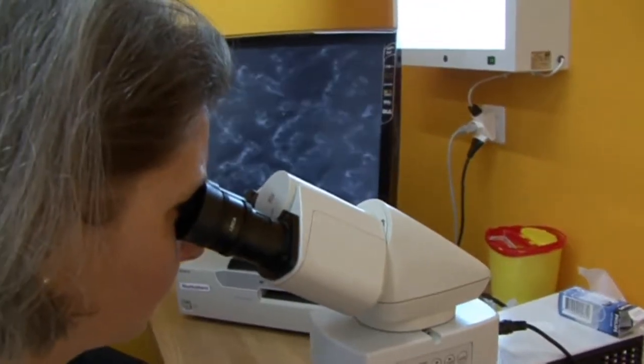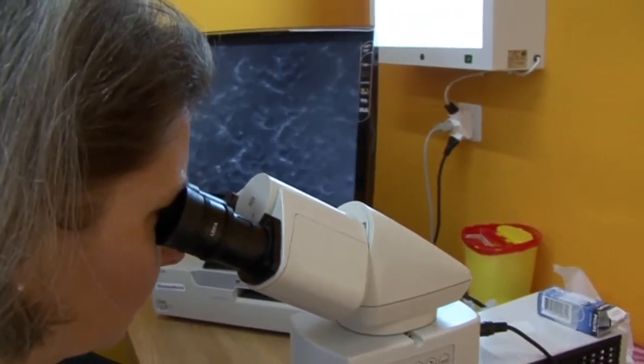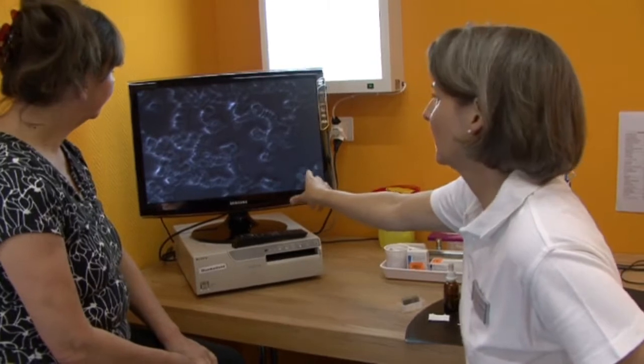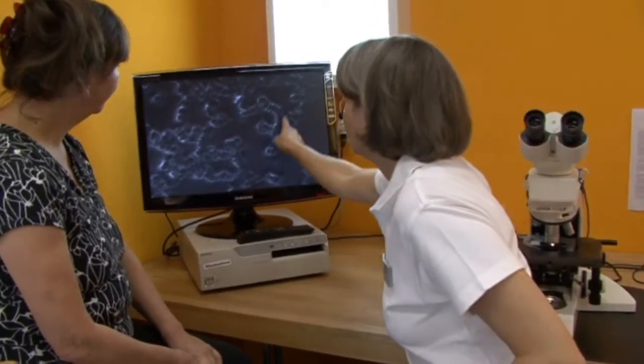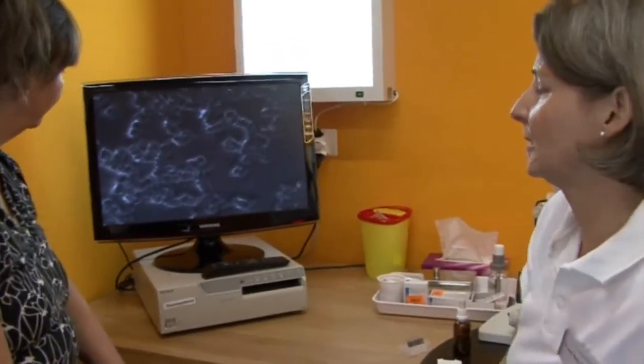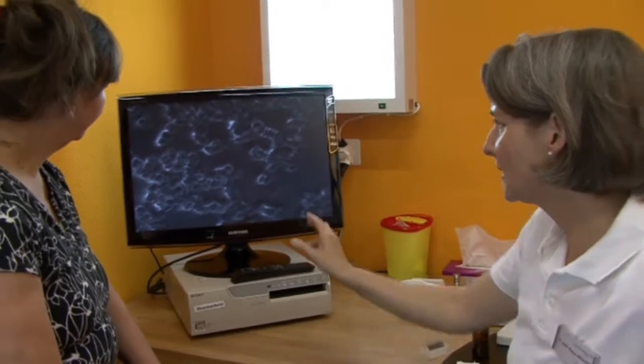Darkfield Microscopy is an examination of freshly drawn vital blood. Here we can analyze the functional ability of both the red and the white blood cells.